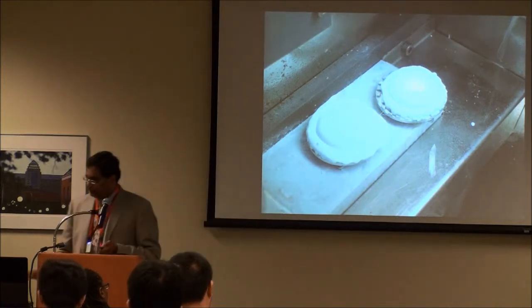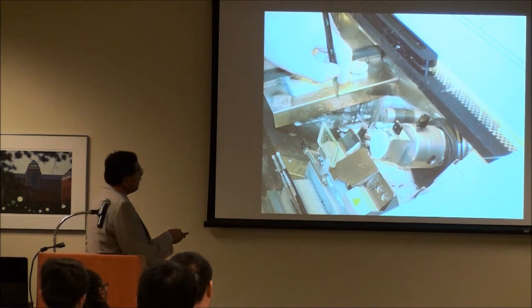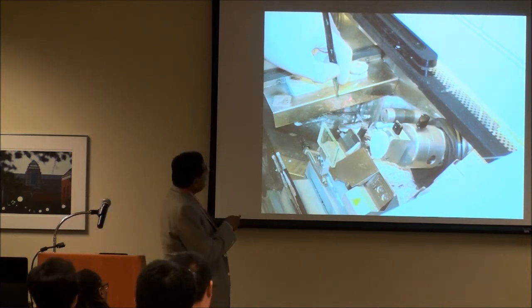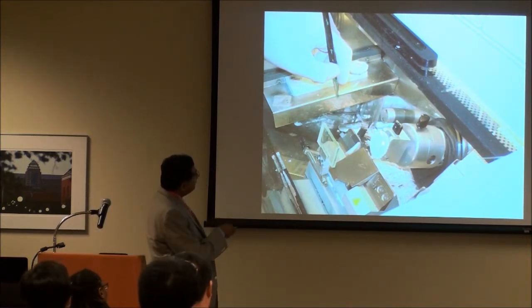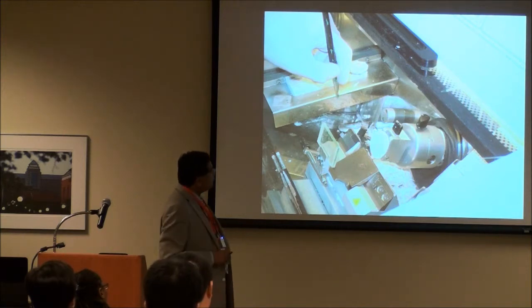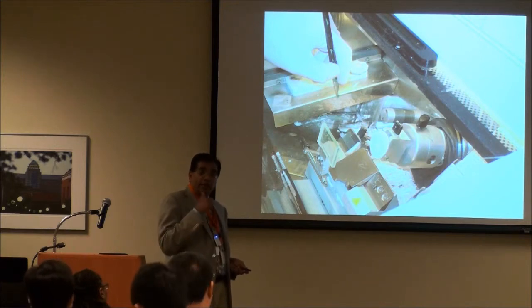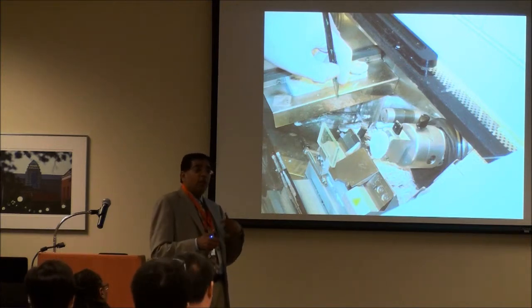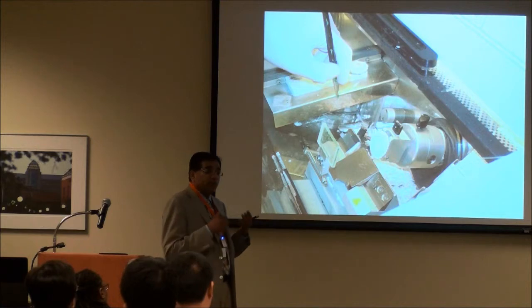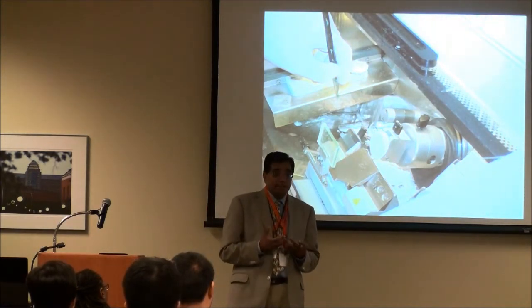Then this is called a microtome, and you can see these two frozen blocks here, and then we take sections of these blocks right away. After you take the sections, they get stained. I look at it right away, and within 20 minutes I call them up and tell them it's cancer or no cancer, or whatever the question the surgeon is asking.